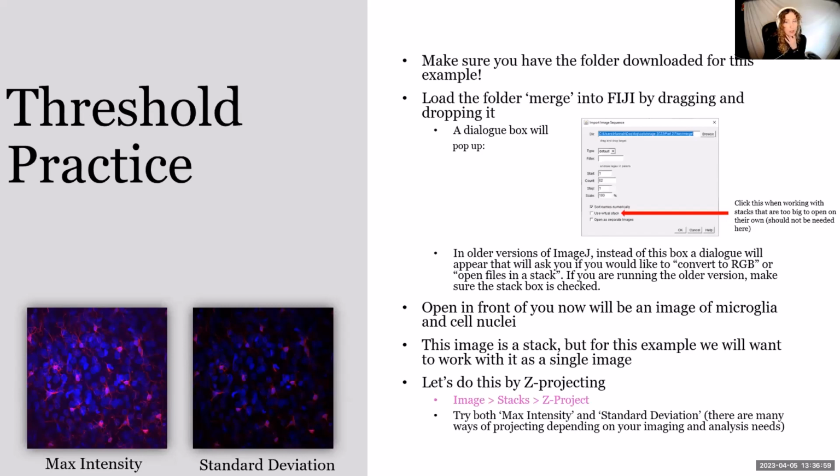So standard deviation, if you go to Image, Stacks, and Z Project, it will bring up a dialog box. And in that dialog box, there's a drop-down menu, and that's where you can find standard deviation.